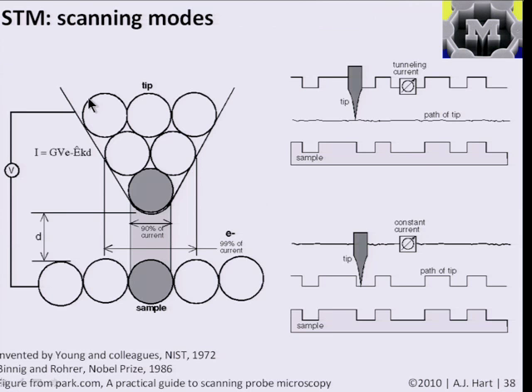And certainly there's a lot of physics behind this, for example, how you control the current or how you control the position of the tip. But if you ideally had a tip that was 1 atom sharp, this effect is so confined that you can make the assumption that most of the current is going between the sharpest point of the tip and your sample, and you could say even more of the current is going in a slightly larger zone.